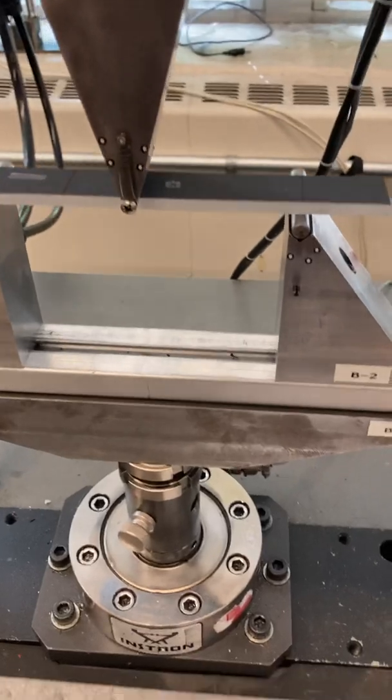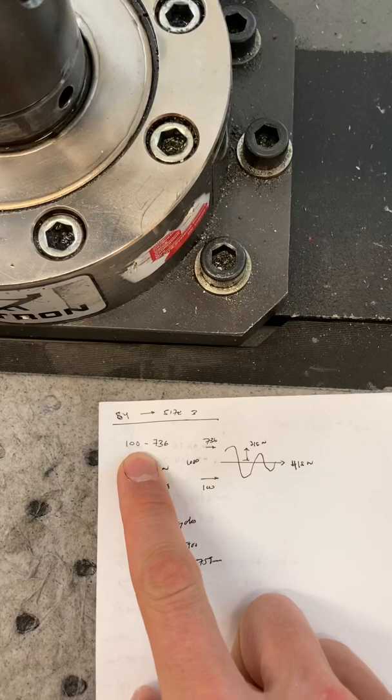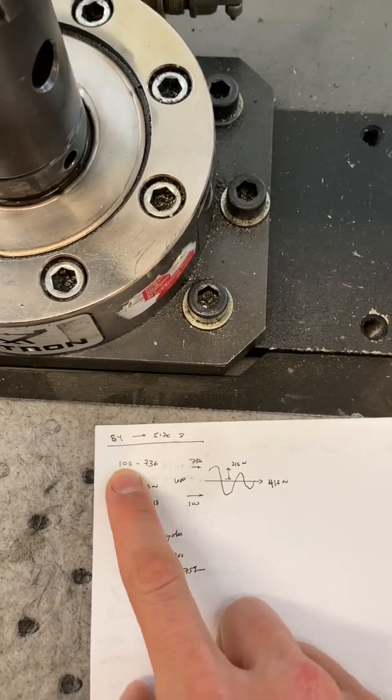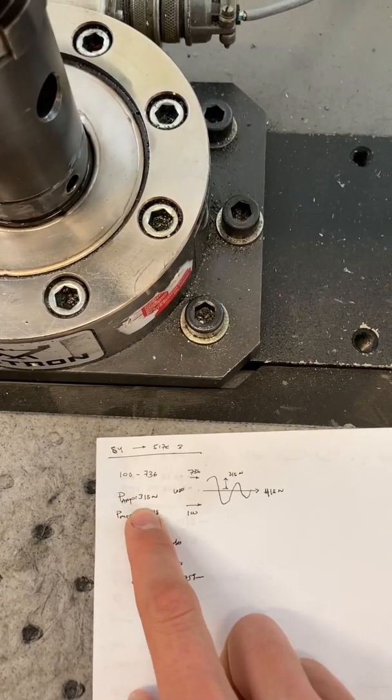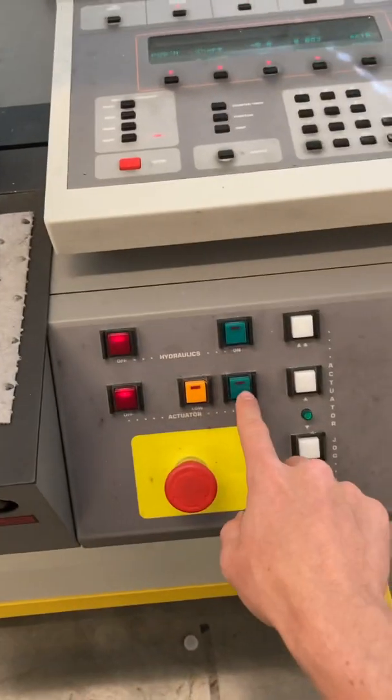For our test I'm going to show a size 3 example. From previous calculations, we determined that our load amplitude is going to be between 100 and 736 newtons, so the amplitude is going to be 318 with the mean at 418. We'll turn on the actuators.